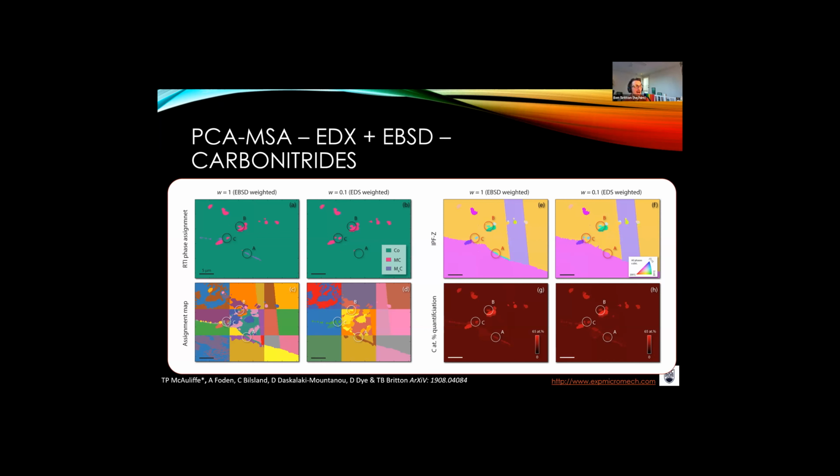I don't like it. Occasionally we have to, so there are some specific problems where we've done data cleanup, and that's software post-processing based upon the spatial observations of orientation data. The huge benefit of doing the pattern matching is you're just looking at the physical signal and saying what's the best classifier. And specifically the physical signal, the MapSweeper is just more sensitive to rubbish patterns.